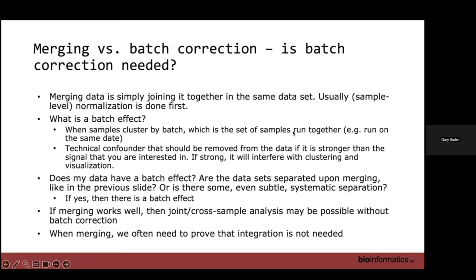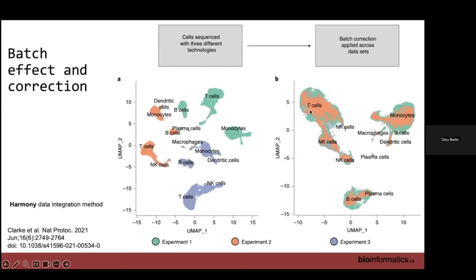What is a batch effect? How do you know that you have one in the data? Generally, the phrase 'batch effect' means that samples are clustering by batch. A batch is the set of samples run together in some way, like run on the same date. A batch is a technical confounder that should be removed from the data, especially if it's stronger than the signals you're interested in. For instance, if we're interested in cell types, we'd like them to group together, but because the batch effect is so strong, it's actually grouping by batch instead of by cell types.